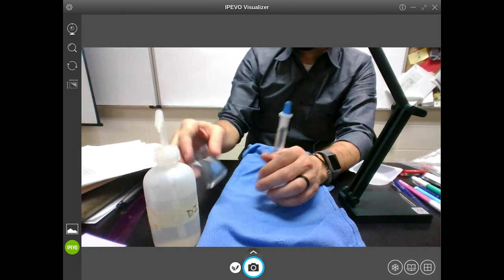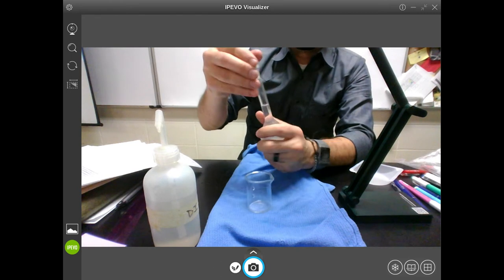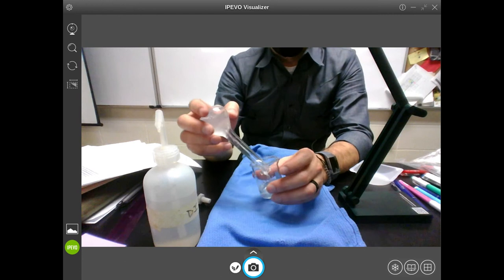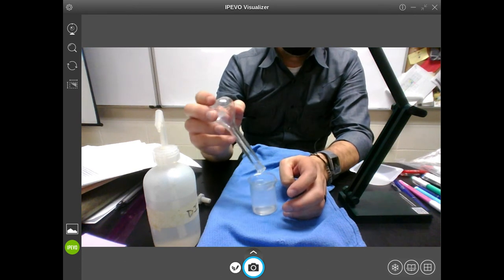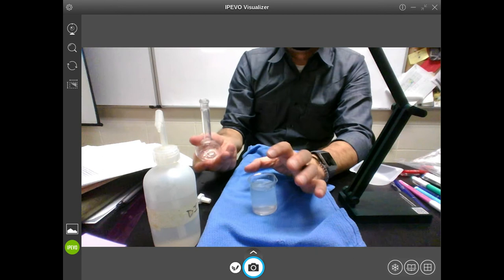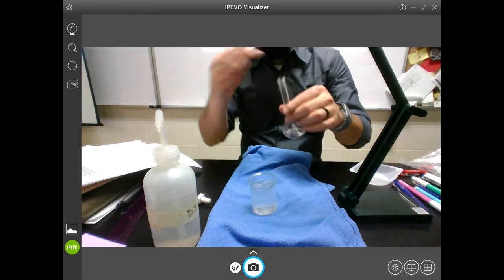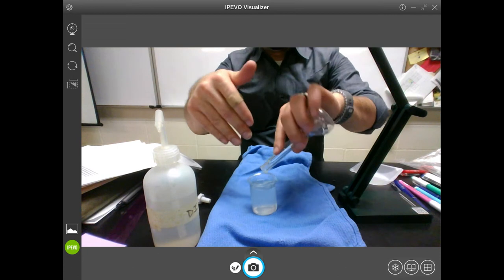Okay. Then when you go to transfer it to the container, just make sure it's really mixed well. It's not going to be a beaker, but you transfer it to the container. Okay. Transfer it to your container. You got to cap it. You know that container is that molarity. You're not going to be rinsing this out or anything, because if you add any more water, you're changing the concentration. You're just transferring it.